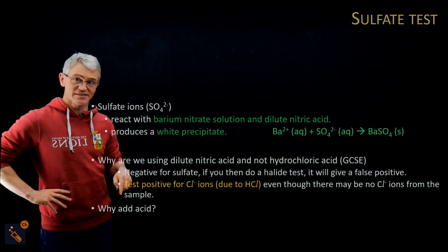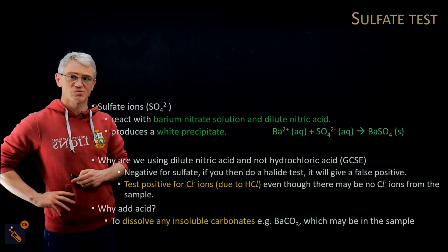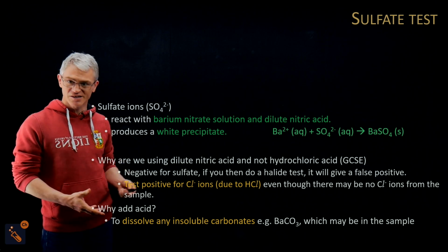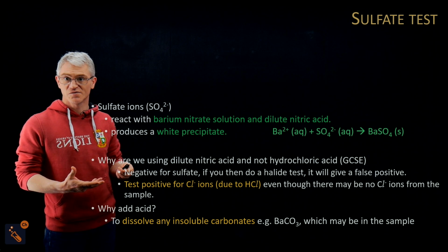Now, why add the acid? This can sometimes be a funny question as well. That's because it dissolves any insoluble carbonates. So if there's a carbonate in there already, which you can get within some solutions, it gets rid of those carbonates. So basically, you can still test for that.